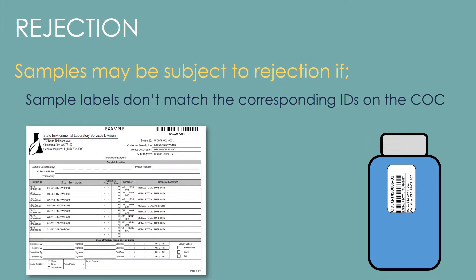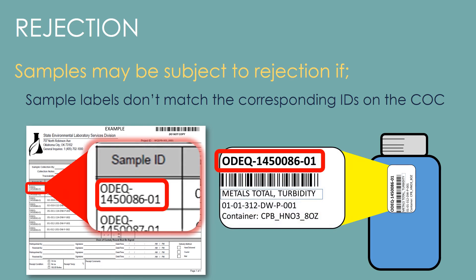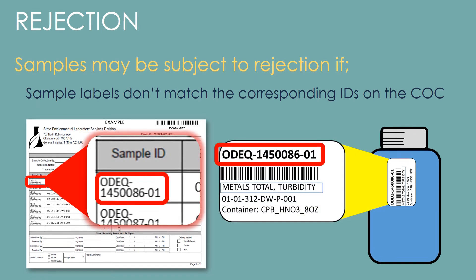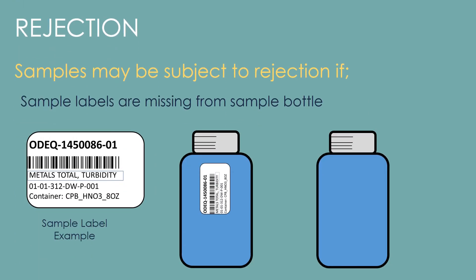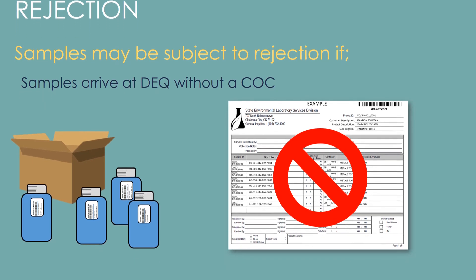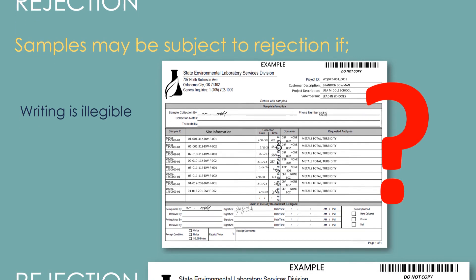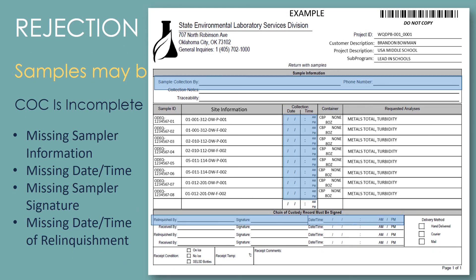If protocol is not followed, samples may be subject to rejection. This includes: sample label IDs did not match the IDs on the chain of custody, sample labels are missing, samples arrive without a chain of custody, writing is illegible, or chain of custody is incomplete.